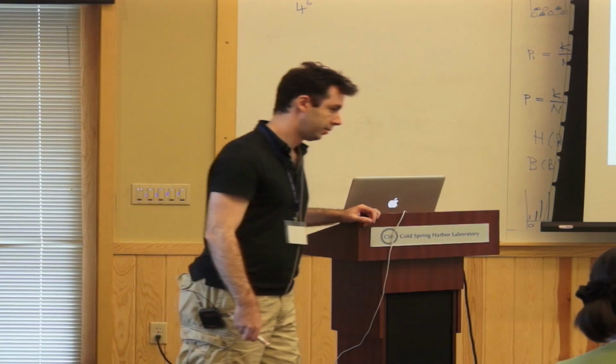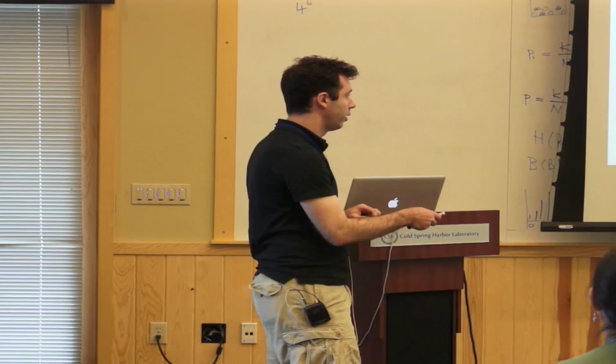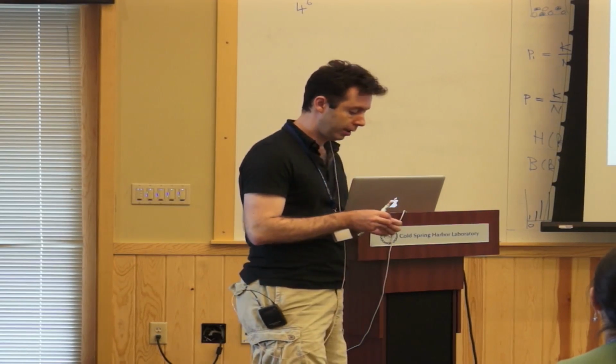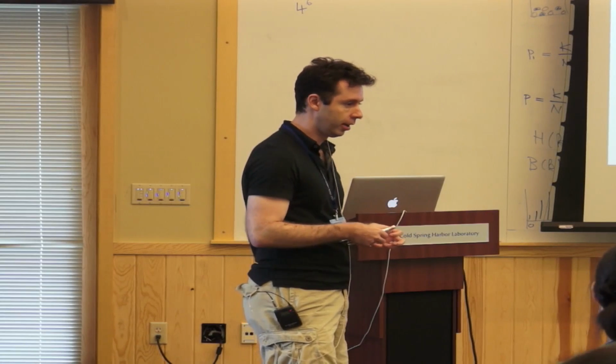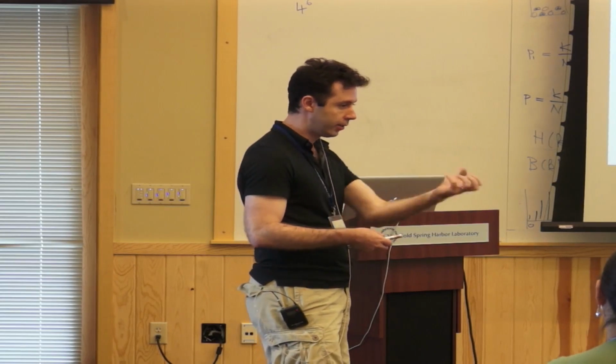Going back to the difficult problem of the one that doesn't have a motif. Yeah, that is potentially of great interest, absolutely. So what are the best approaches to tackle this problem? So basically what you want to do is pull down the factor that binds to this. You can make oligos, DNA sequences that have multiple copies of the same motif. You can put them on beads, for example, and you can use that as a way to pull down whatever binds to the oligo.